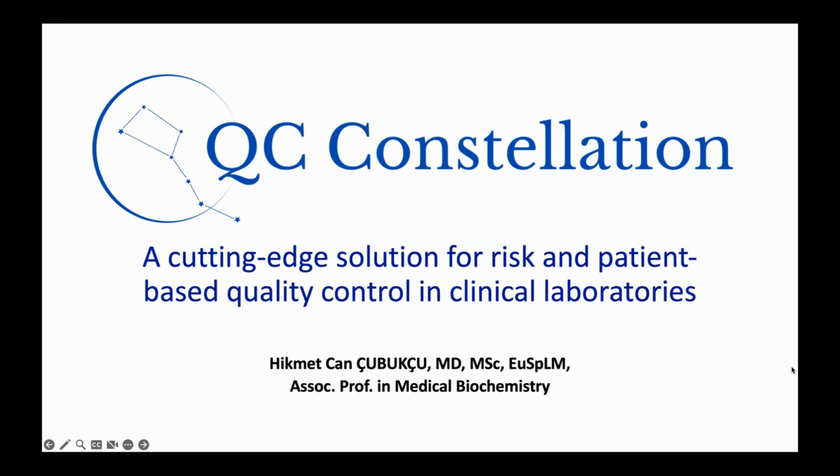In this video, I will talk about risk-based and patient-based quality control and introduce my web-based application, QC Constellation.